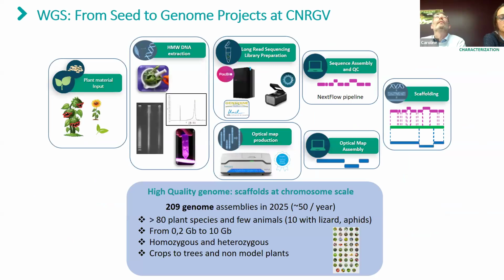And because the scientific, the good starting point is the genome. A lot of times the researchers come to our lab and they want to have their genome. So we think that it was the best tool to start with their plant material and to give them at the end the whole sequence of their genome. And so for this purpose, we acquire all the expertise at every step.